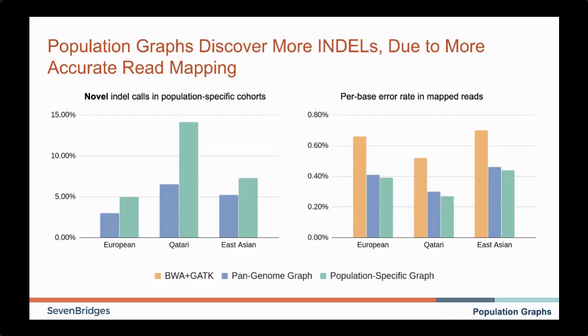Frank Pullman, are you exporting phased VCFs as the default? Is your variant caller phase aware? Not in this version, unfortunately, but it is an enhancement that is on our roadmap. That's as far as I can tell you at this point.